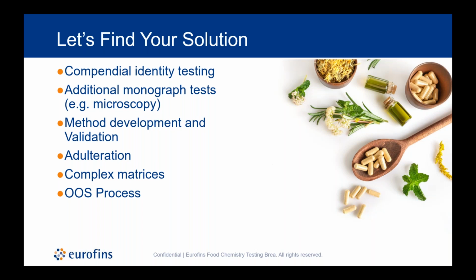Basically, the next steps, we can verify that the sample submission that was provided with the sample was interpreted accurately, that there's no new information that would alter the way the sample should be submitted and ultimately tested, making sure that the method that was used is applicable. Sometimes that information does turn out to be different in reality from what was understood at the time of sending the sample. So that's really the big thing, making sure that we did in fact perform accurate fit for purpose testing, checking all the boxes there.